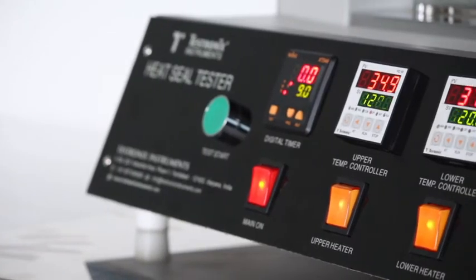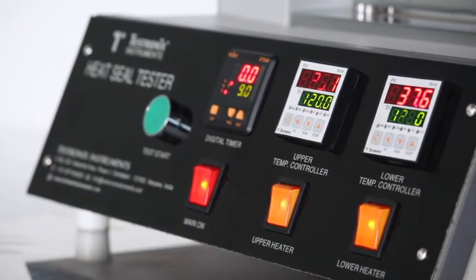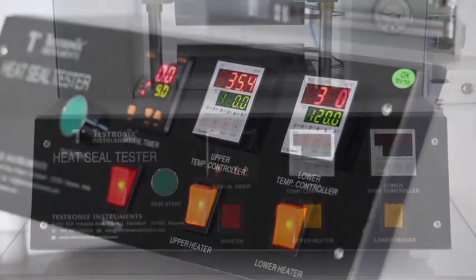The high-resolution counter-control of the single-chip microcomputer provides highly accurate dwell time.